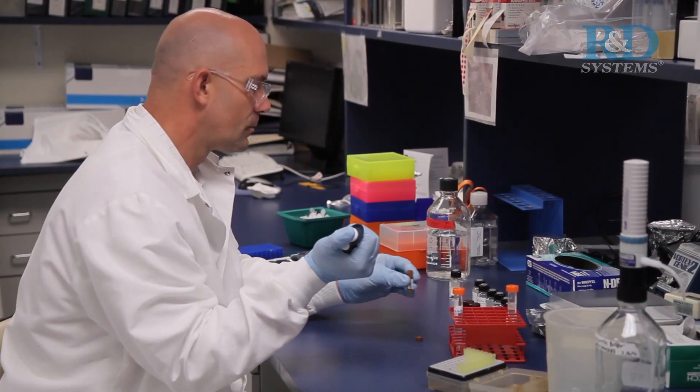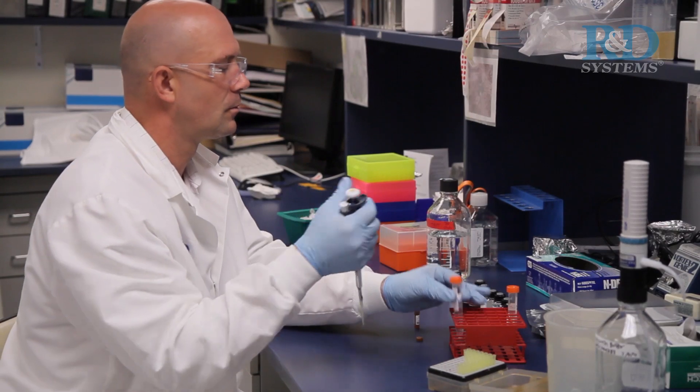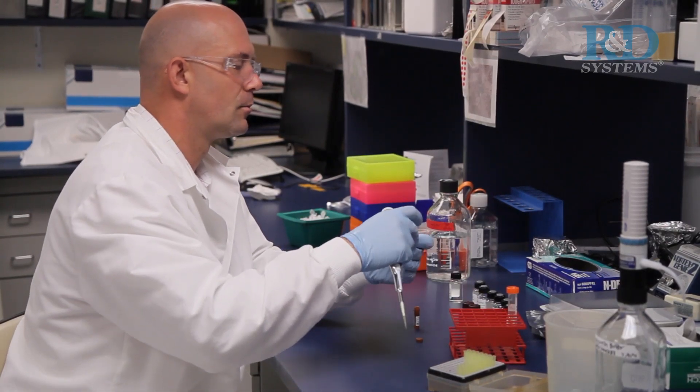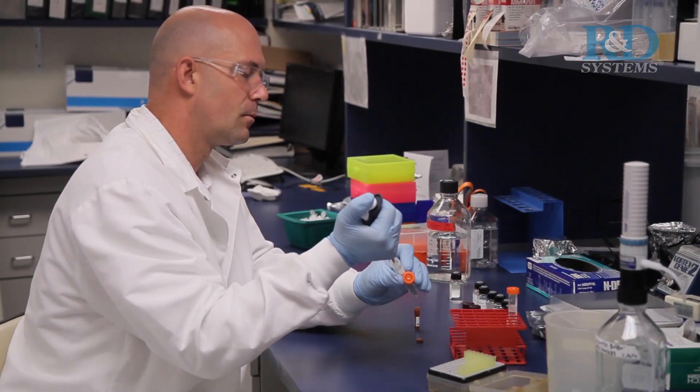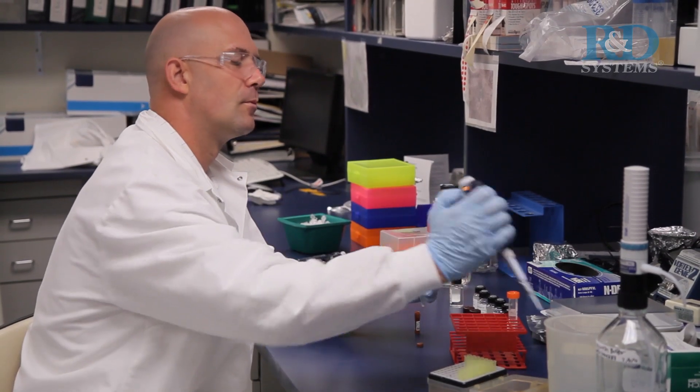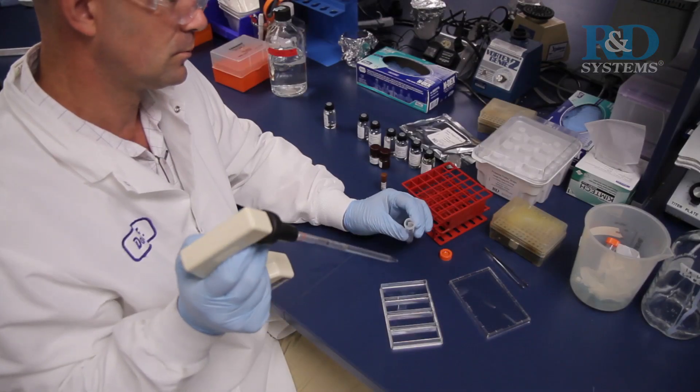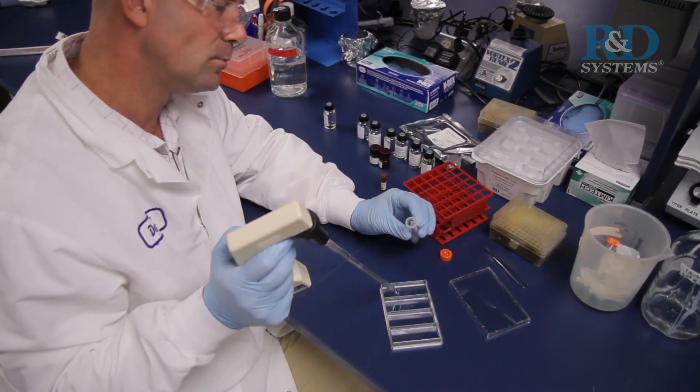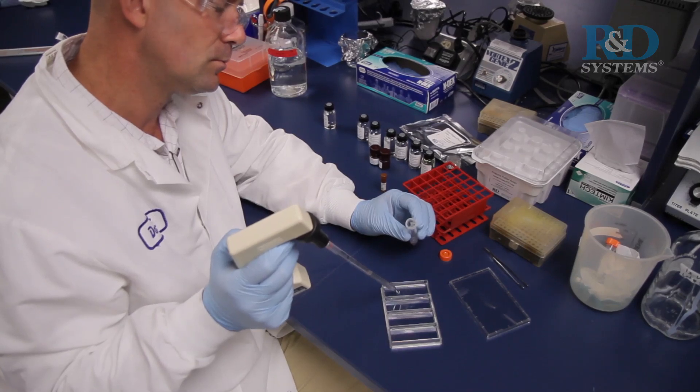Dilute the antiphosphotyrosine horseradish peroxidase detection antibody in 1x array buffer 2 using the dilution factor on the vial label. Pipette 2.0 milliliters of diluted solution into each well of the 4-well multi-dish.